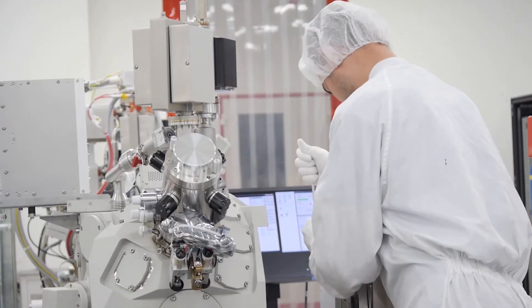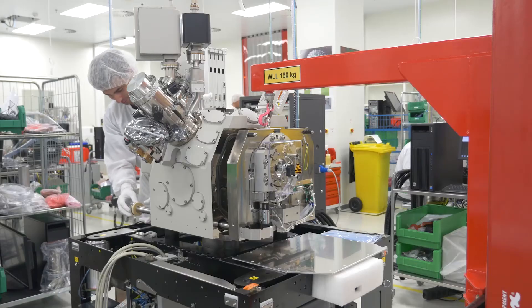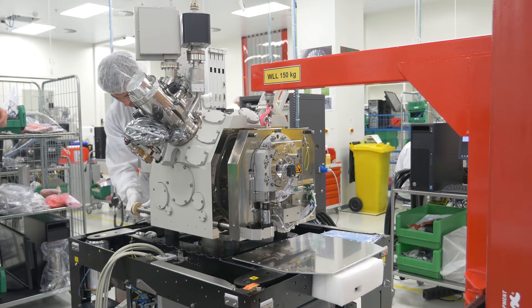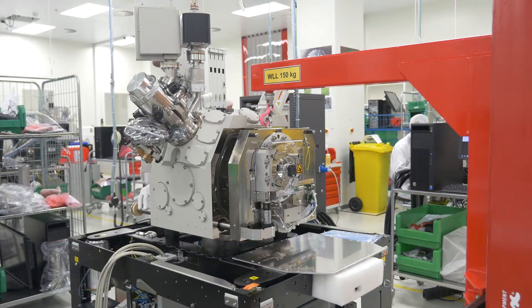Critical operations include the mechanical setting and centering of individual parts of the optical system with a precision of thousands of millimeters. Here they work literally in kid gloves.